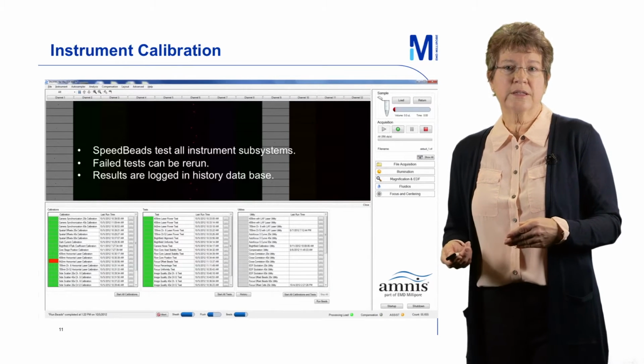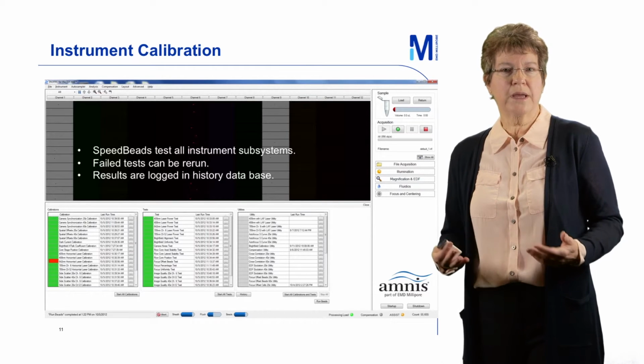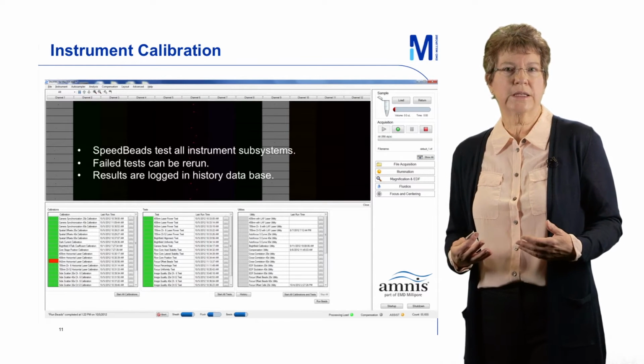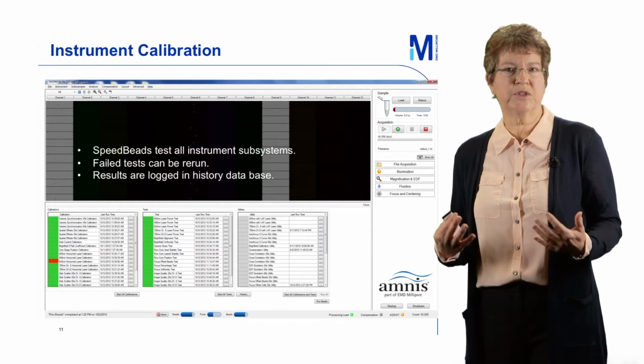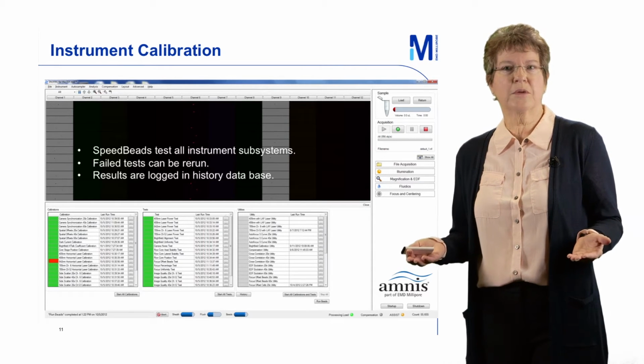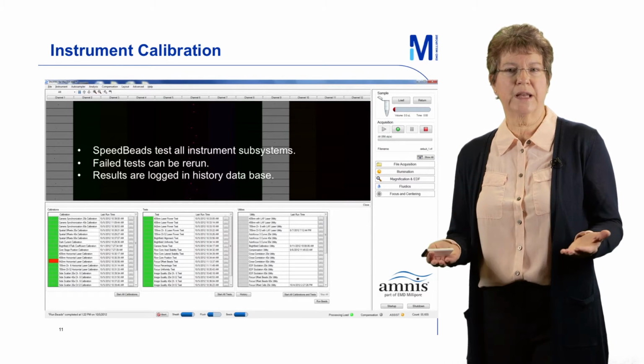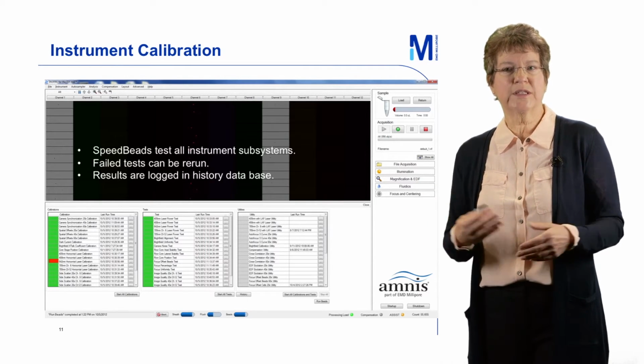The way the system is designed is so that there's automated calibration and tests that you run every morning when you start up. It takes about 15 minutes to get the system going, and it's all automated and calibrated. And if there's any failures, you'll see a red flag.